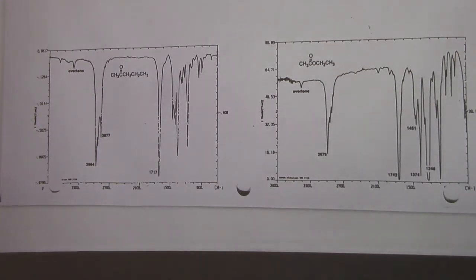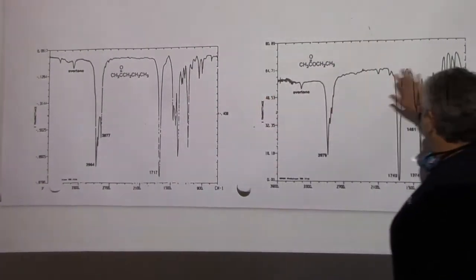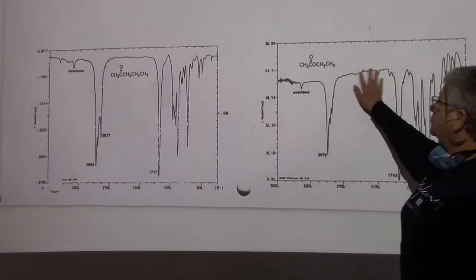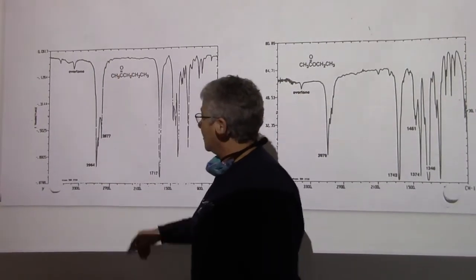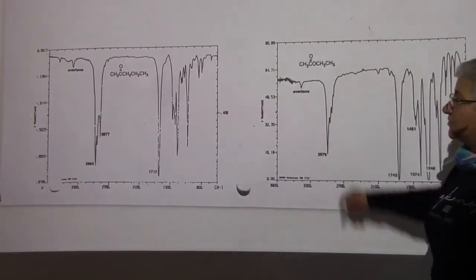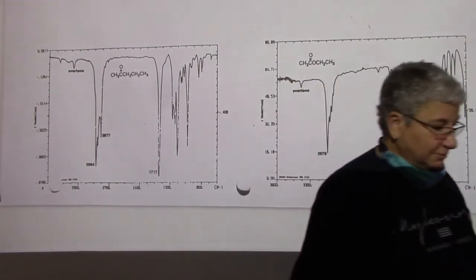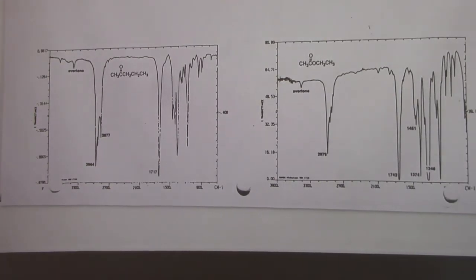Okay. So now we're going to look at the bottom 2, and let's look at them together. When you look at these spectra, you see fingerprint, you see a carbonyl, you see no triple bonds, you see CH stretches, and then you see no OH or NH or hydrogen on a triple bonded carbon. And so these spectra to me look, I mean, they're not identical, but they're incredibly similar.